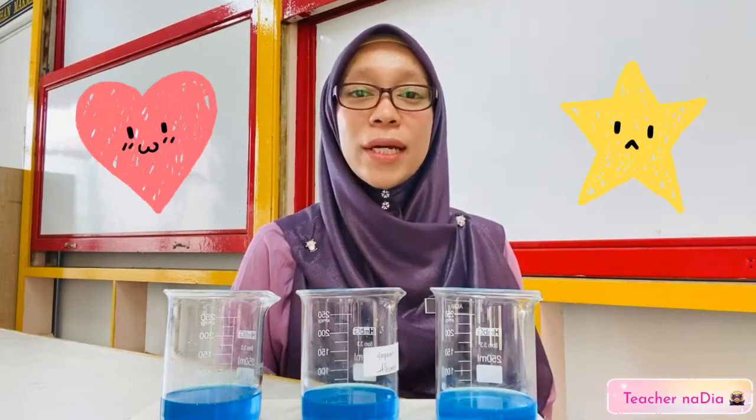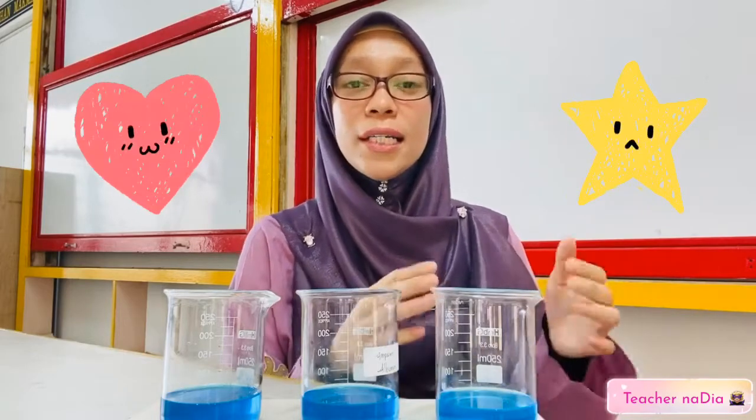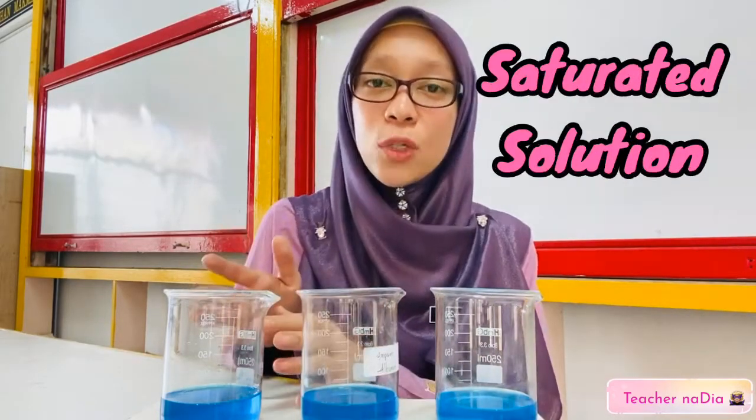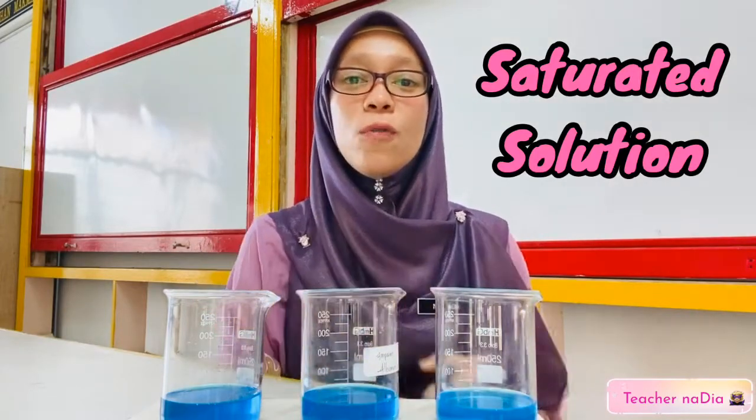That's all for activity 5.5. So hopefully you can differentiate the 3 types of solutions, which are dilute solution, concentrated solution, and also saturated solution. And hopefully you can answer all the questions given.